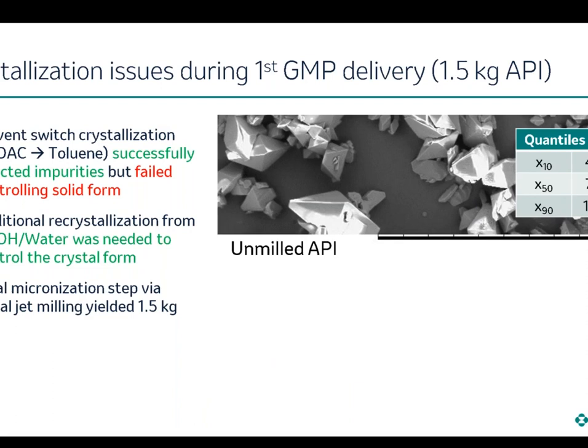Now, coming to today's system I'd like to present: I joined this project just after the first GMP delivery, when 1.5 kg of API were available. You have to imagine there is a lot of demand for this material. There are tox studies that need to go on, stability studies, and formulation development for further clinical runs, so the crystallization group is in line to get its fair share.